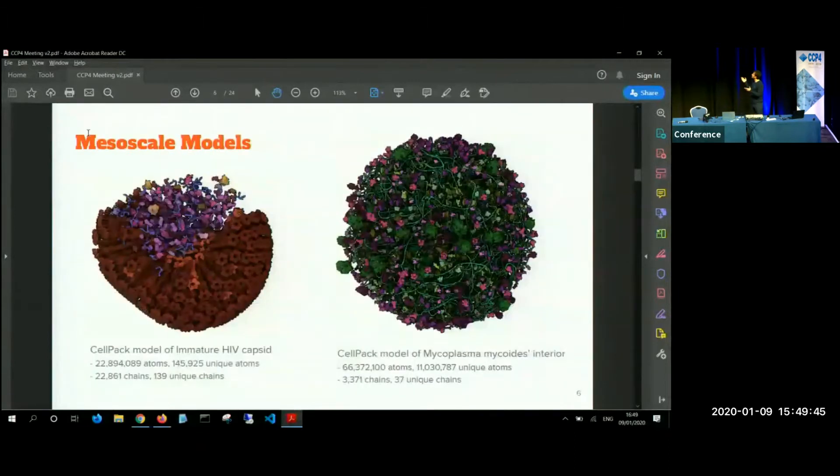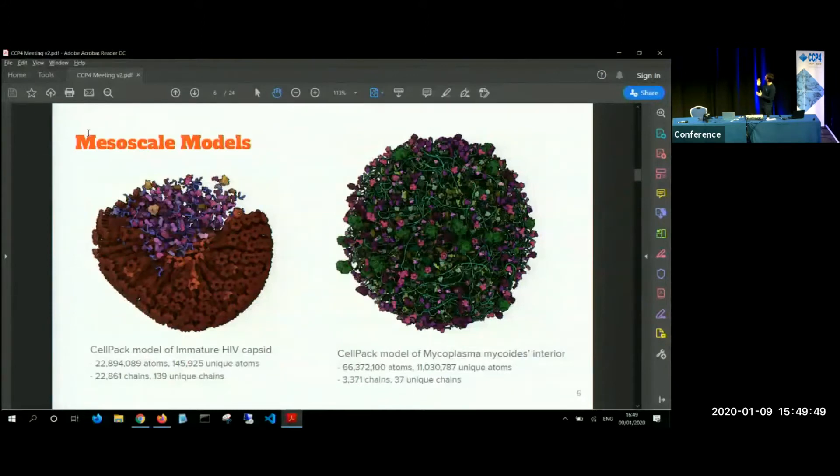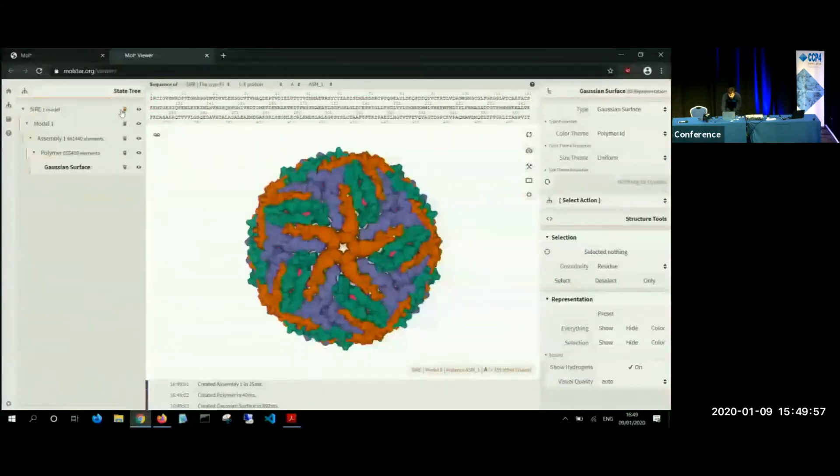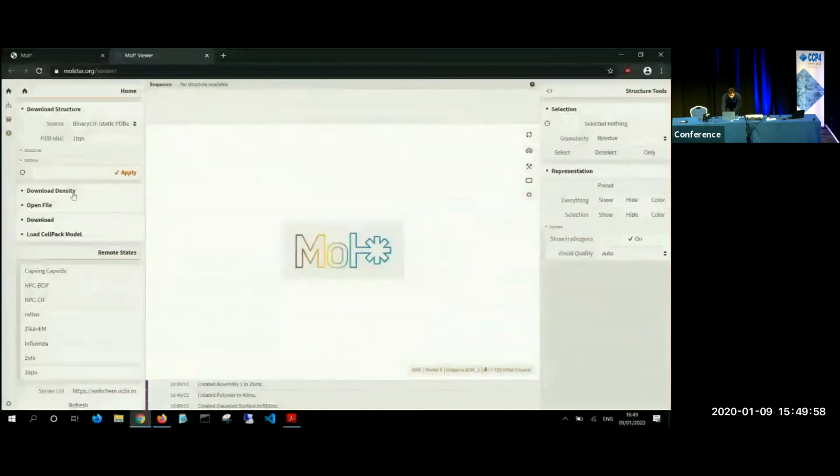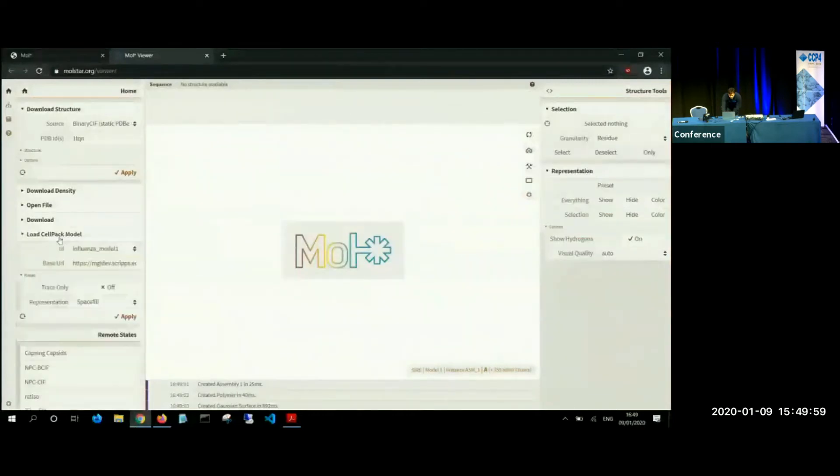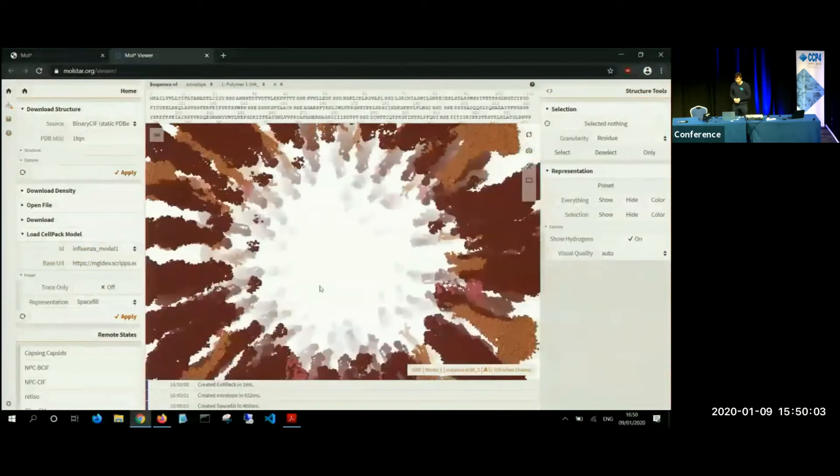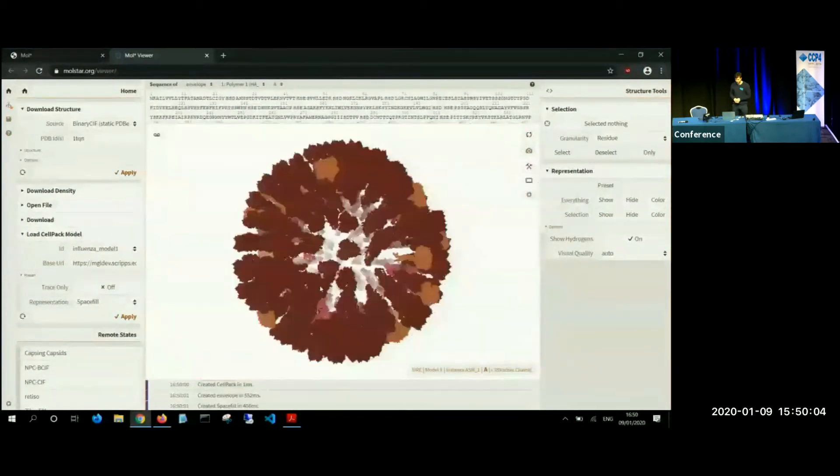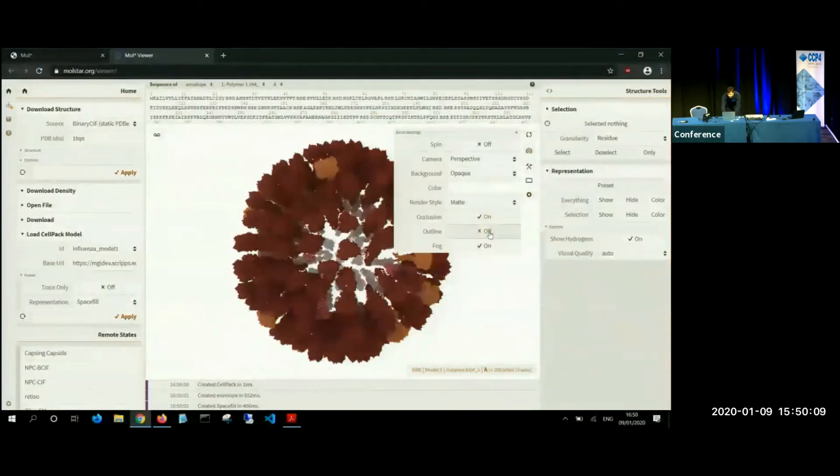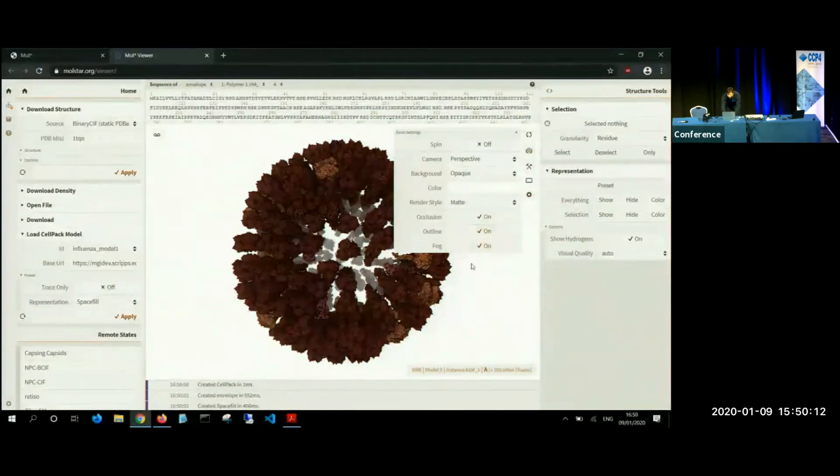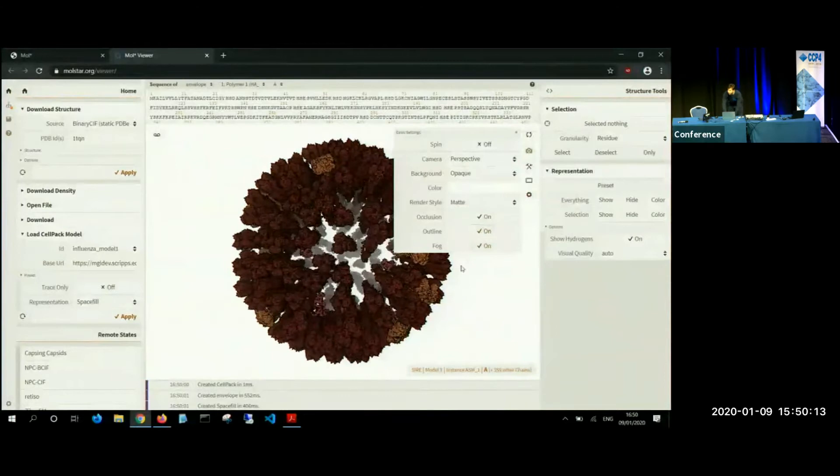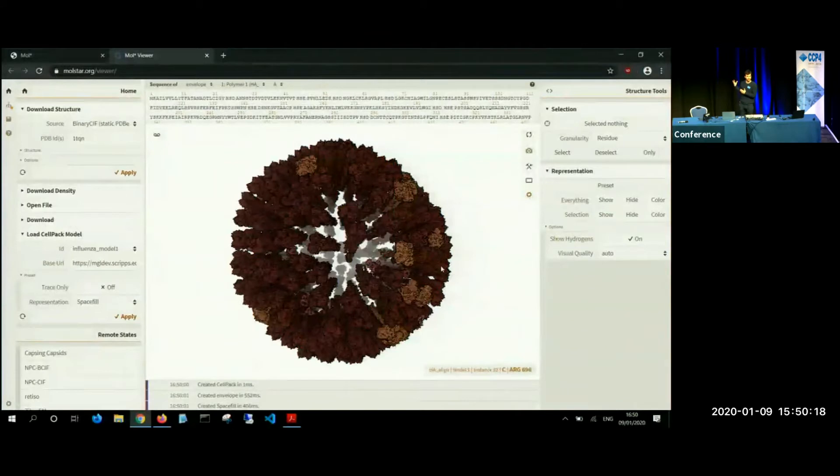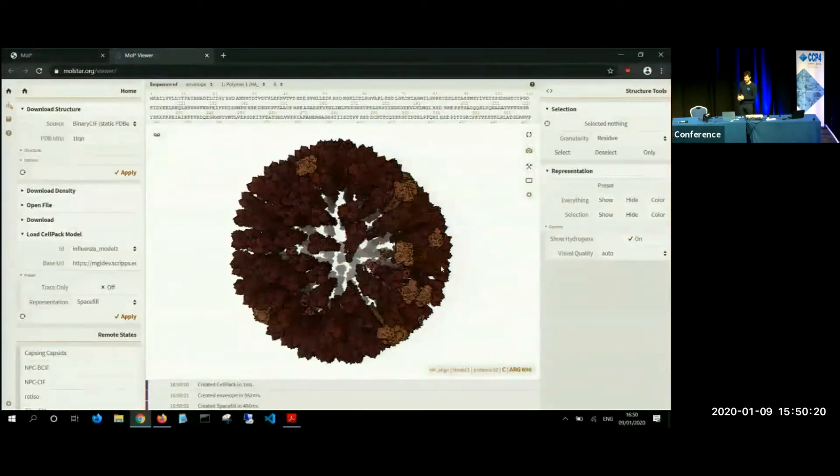And there are two more examples of these mesoscale models. For example, the cell pack model of the mature HIV capsid or mycoplasma. Again, to show you that it can really be interactive, even on this four year laptop. I can, for example, load this part of influenza model from cell pack. And as you can see, it loads almost immediately. I can change it on Gaussian and give it an outline. And I have a very fast, very interactive model in a web browser that the users can interact with and play around.